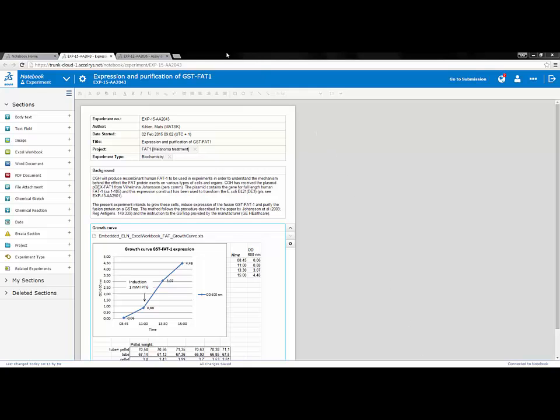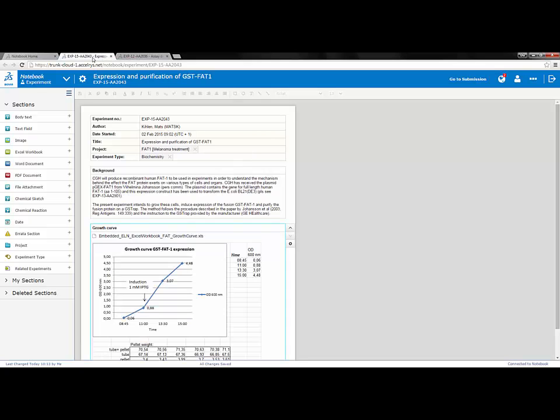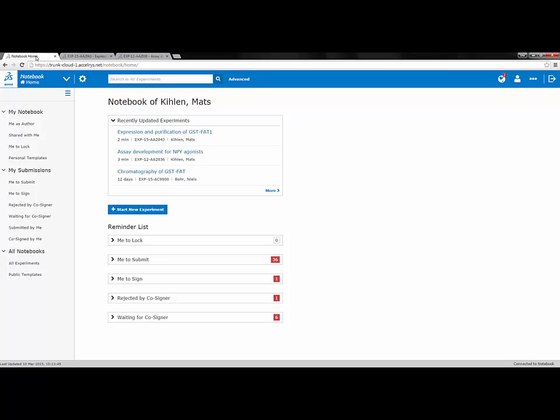Having experiments open in different tabs allows you to quickly switch between experiments or the home page. The home page automatically refreshes and updates depending on what is happening within the experiment editor.